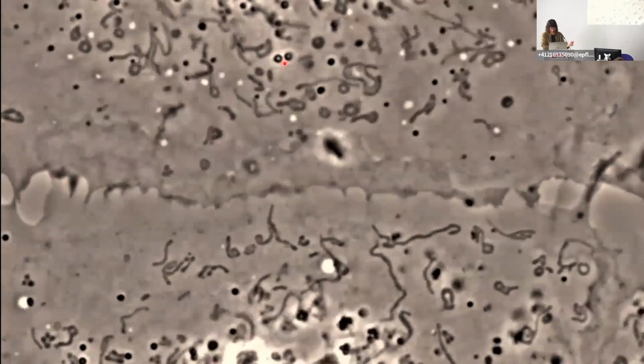So here you can see the edge of a cell. And in each of the cells, you can see some mitochondria as well as some other membrane structures. We can follow mitochondrial dynamics. And so you might think, great, you've already solved the problem of fluorescence. How much harder could it be to do the same thing in phase? One of the issues with phase is that there's a lot else that is giving contrast to the imaging, and those give rise to false positives in our neural networks.